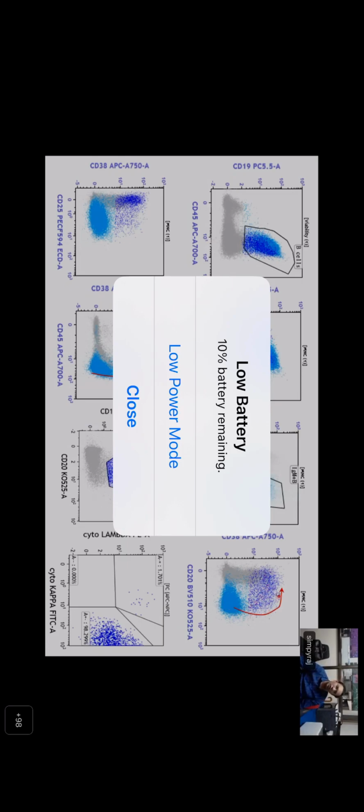So they can show a maturation pattern. You can see these plasma cells highlighted with dark blue color, CD138. They show clonality, and typically CD25 dim positive, CD19 positive, CD20 positive, IgM positive, and CD45 positive B cells. These plasma cells are typically CD19 positive.